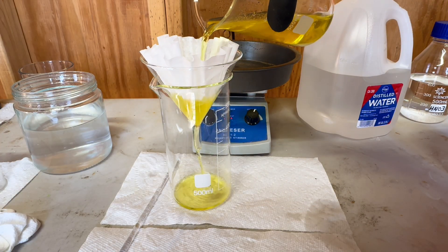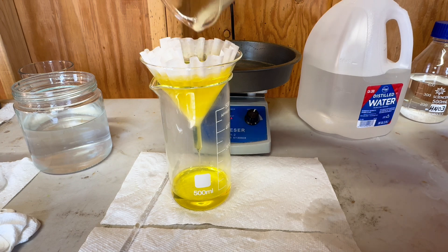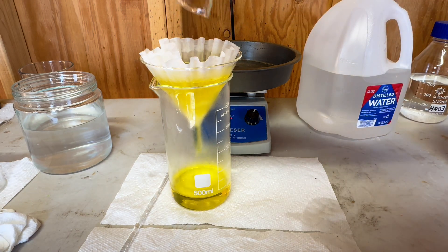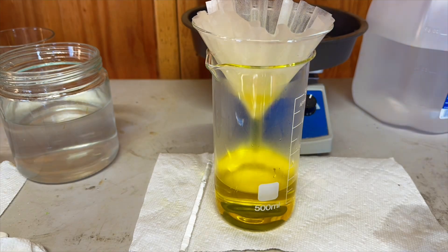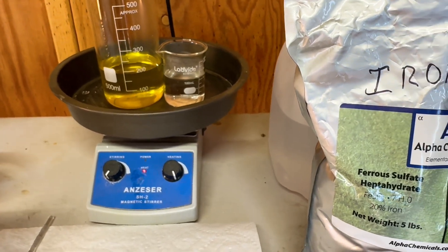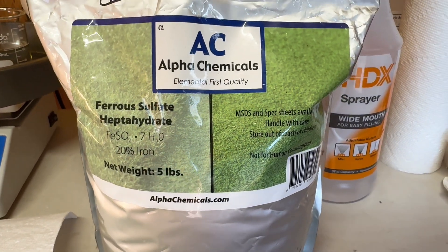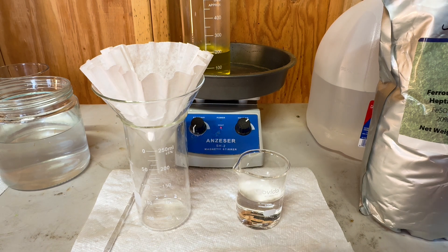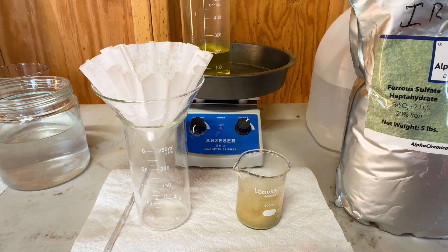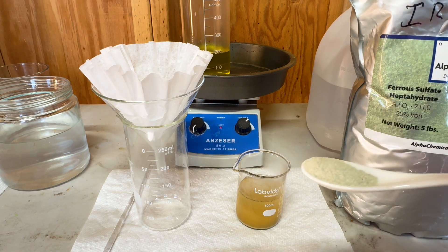We will filter out our sulfamic acid from our aqua regia. I have 60 milliliters of distilled water heating up, and I am going to use this iron sulfate and mix it into the distilled water — this is what we are going to use to drop the gold out of the aqua regia. I am now going to add in 2 teaspoons of iron sulfate into our heated 60 milliliters of distilled water, and once I mix it up I will filter it out to get the sediments out of our iron sulfate.